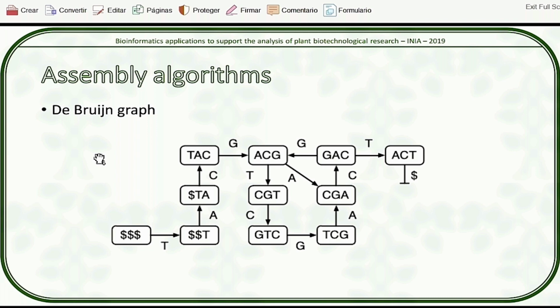You have to choose the appropriate k-mer size. And there are a bunch of techniques to choose the appropriate k-mer size. That's why we do a k-mer analysis before we start with the assembly. Because we can predict which k-mer size will be more favorable to get a more contiguous assembly. We can predict that.